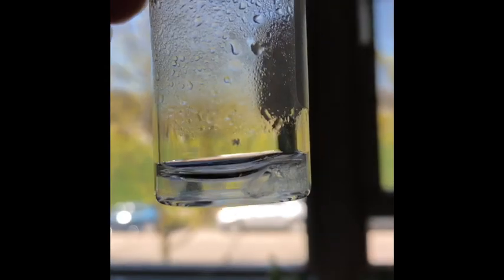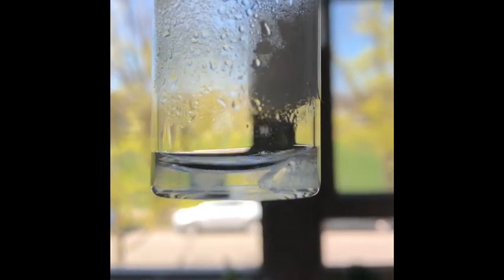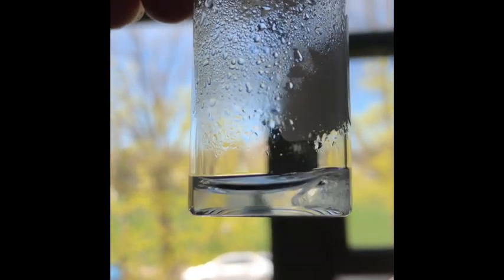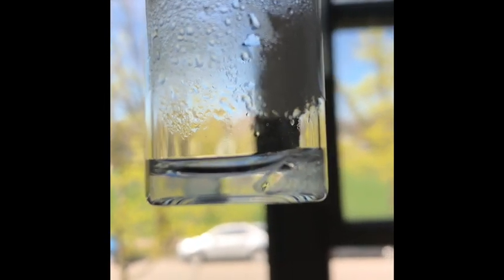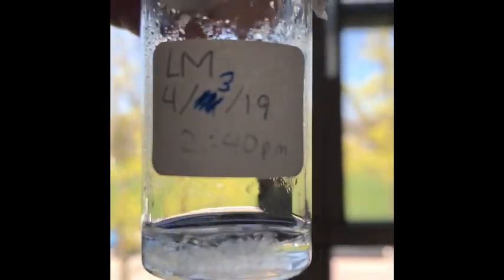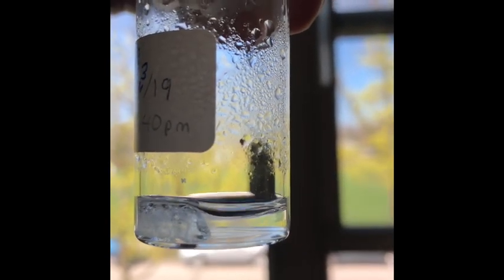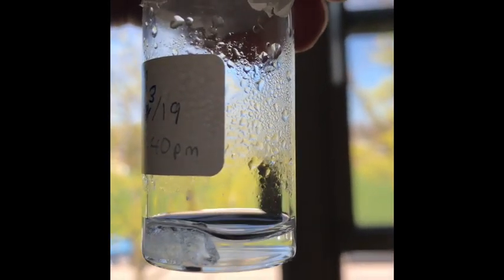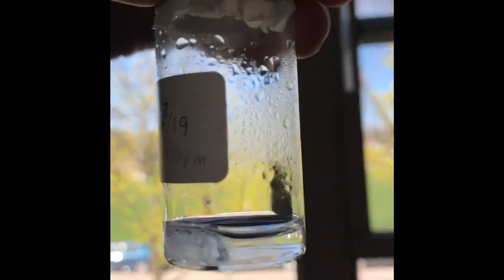Another factor that I believe may affect the purity and the quality of my crystals is that there appears to be 3 white clumps of maybe mold or bacteria growing in the solution surrounding the crystals. And this could be due to a contaminant that fell in before the solution was sealed, or it may have actually happened after the solution was sealed if the solution was not sealed properly. But there's something growing in there, definitely a contaminant that may affect the crystal.